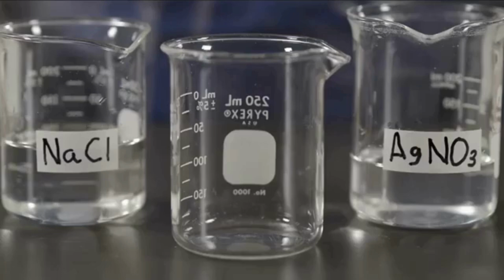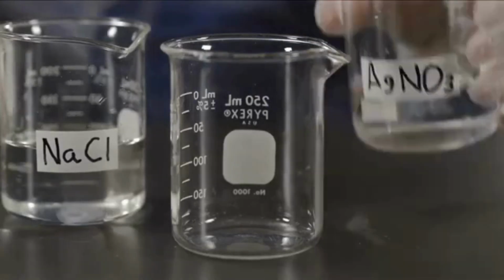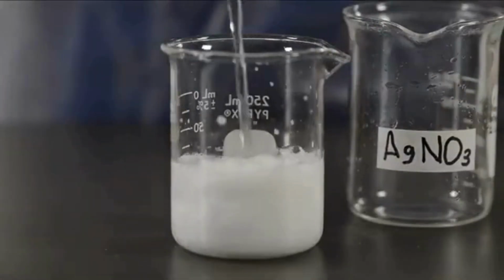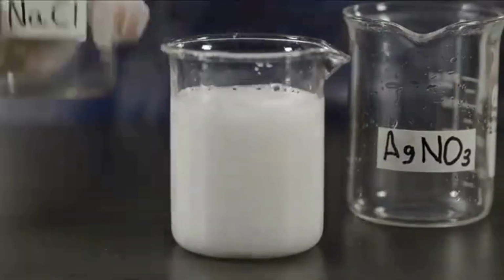Check this out. I have two clear colorless solutions over here. Let's pour them into each other. We pour the first one and we pour the second one, and boom, we now get a white color solution.